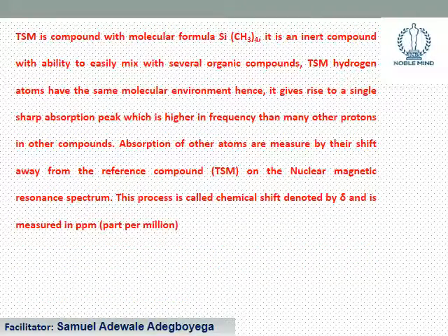Let's briefly discuss the reference compound. It has the formula Si(CH3)4. It is inert and it has the ability to mix with several compounds.